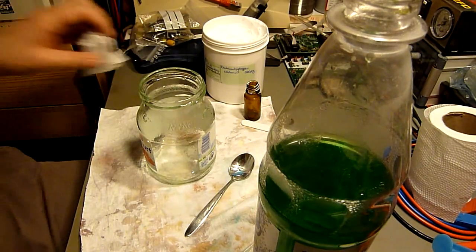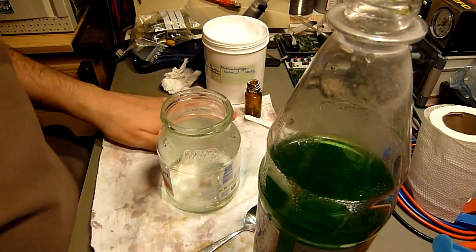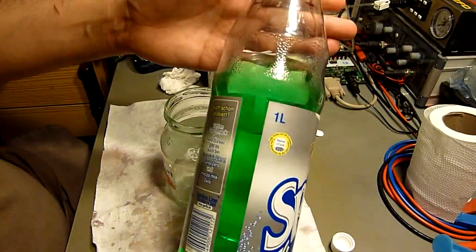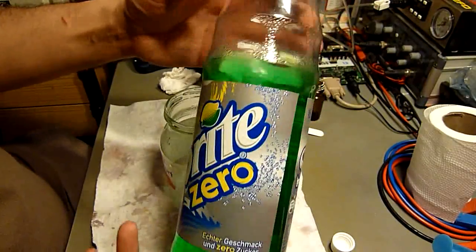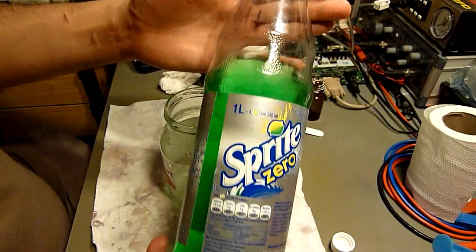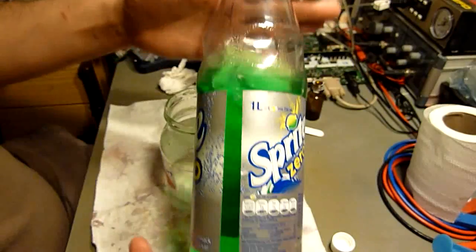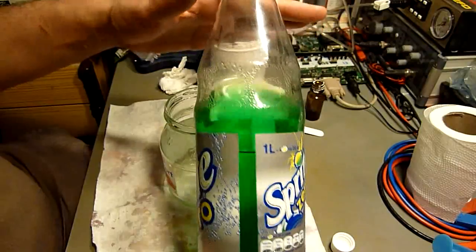Good day YouTube! We etch with hydrochloric acid, at least I do, and some of you probably also do, and we have this problem of disposing of the used etch chemicals, because it is contaminated with copper chloride — this is the green stuff that is in solution — and there is a lot of the hydrochloric acid still in there, and still very sour, which is not good to just dispose into the sewage system. I'll show you a reaction how to get the copper chloride out and to convert it into copper carbonate, which then can be stored separately.